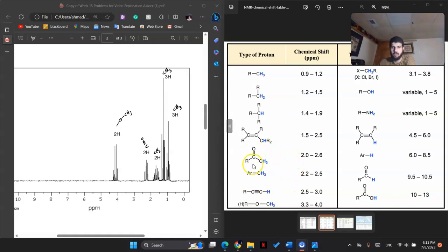and that fell with a hydrogen that is bonded to a carbon that is bonded to another carbon, which is bonded to a double oxygen. I know I drew C double bonded to an O, but I didn't mean for it to mean that specific carbon, because obviously in this situation that carbon wouldn't have a hydrogen, so that peak would not make sense for a carbon double bonded to an oxygen by itself. Rather, it's the hydrogen of the neighboring carbon of the carbon double bonded to an O.